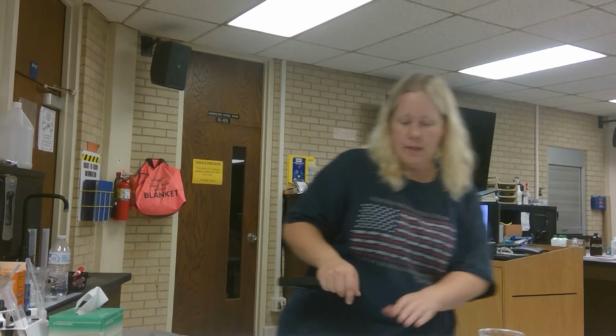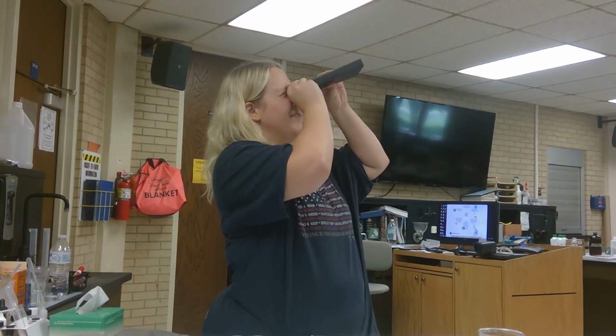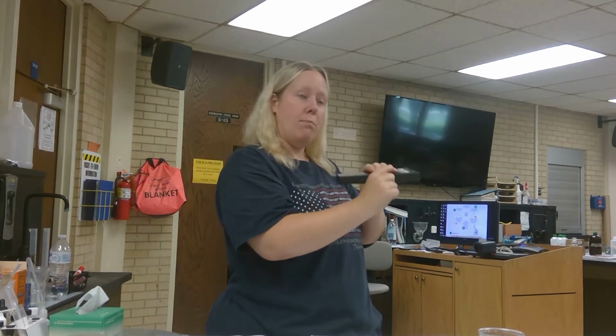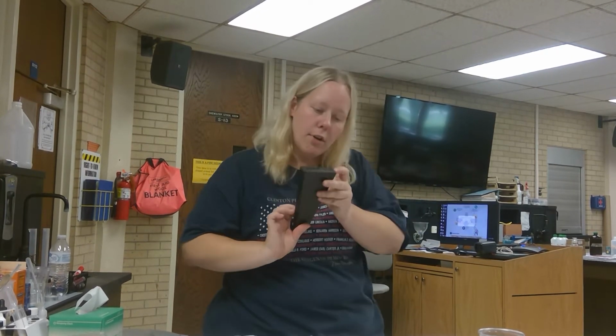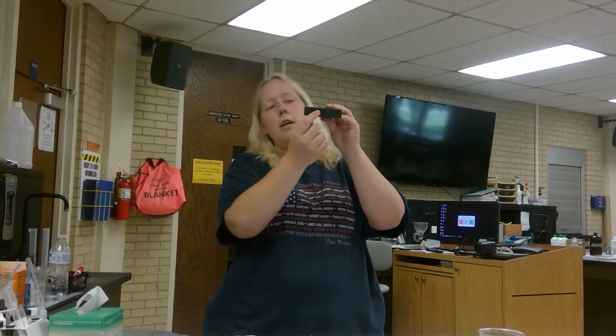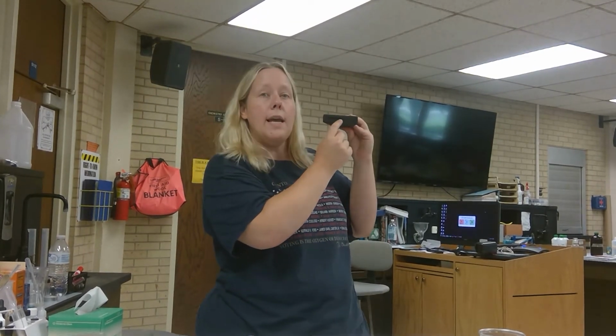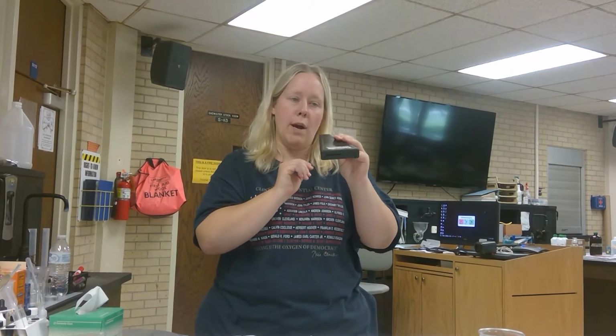Okay. All right, so the first part of this experiment is to take your spectroscope, and you want to have the Carolina portion of the spectroscope facing up. Your light source needs to be pointed in this little slit right here, so it should seem like a bright light. You need to focus that light on your source. And as you do so, you should see over in this section here a scale from 4 to 7. So 4 being on the left-hand side, 7 being on the right.